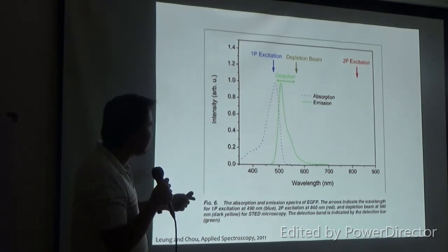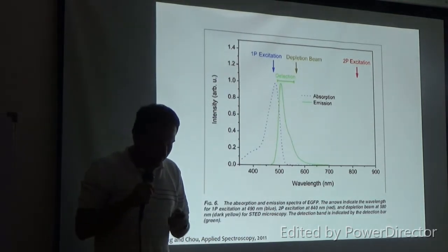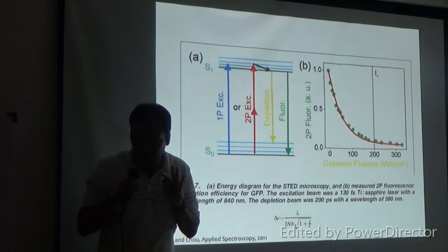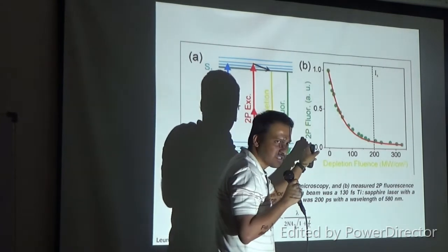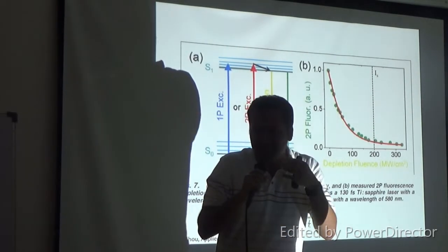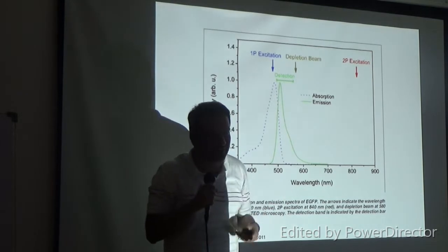So we said that the excitation of GFP was 488 nanometers, emission was 510 nanometers. And now this is your depletion beam, which is about 580 nanometers or so. Let's just look at the one photon excitation. The electrons are going to this excited state. When they come down from this state to the ground state, that's fluorescence. This we understand. Now, what you can do is, if you have a redder photon than this, you can force anything that has gone up to the excited state to come down to the ground state and emit a photon of the same wavelength as that depletion beam, that silencing beam, that red laser, which critically is beyond the detection for GFP, just a bit redder than that.